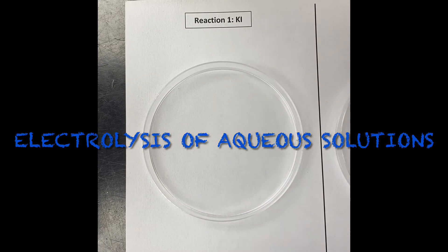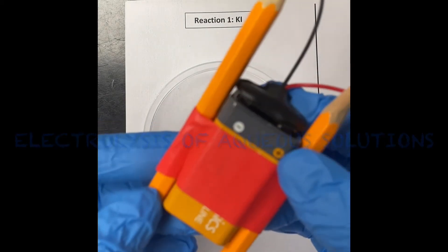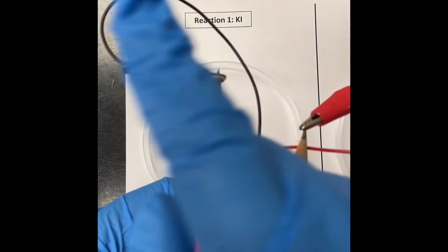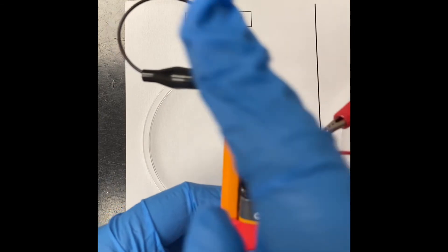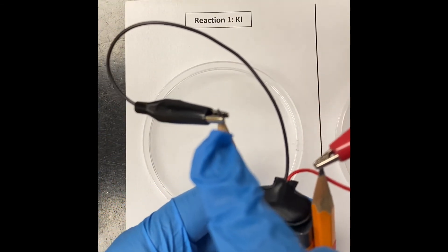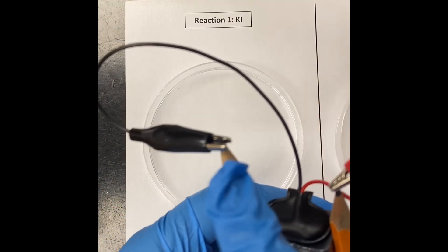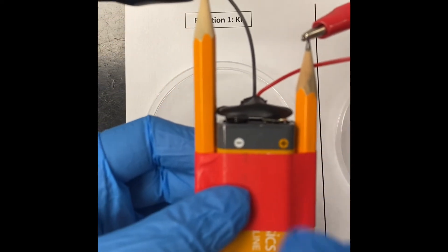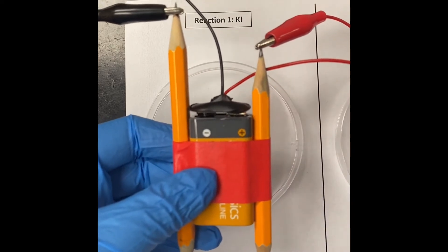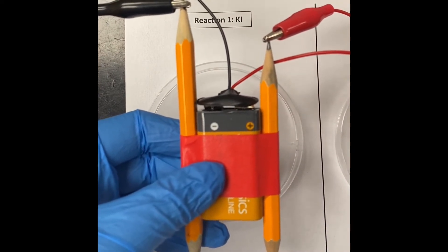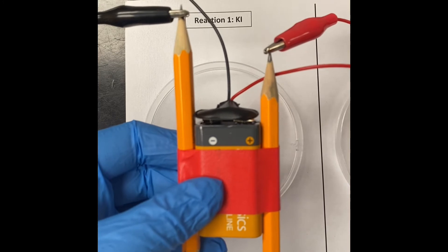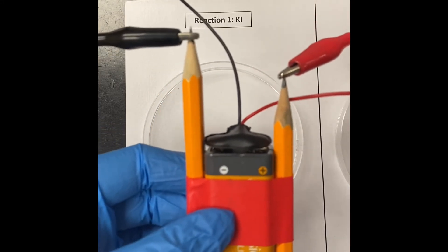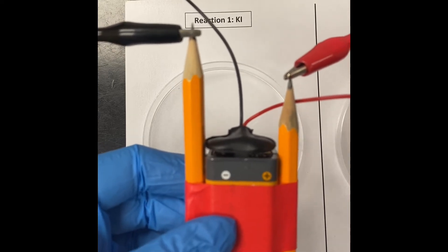So here's my initial setup. I have a 9-volt battery connected to this little clip with wires coming out of it, which is connected to these alligator clips. As you can see, they look like a little mouth with little teeth. I have two pencils that are sharpened on both sides here, and the reason the pencils are sharpened on both sides is because the graphite inside the pencil acts as an electrode and can conduct electricity from the battery into my solution.